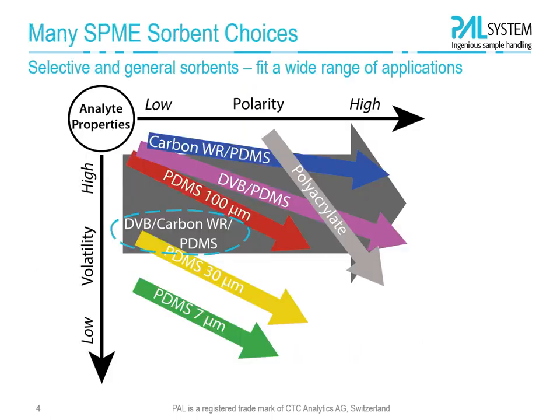As the name says, SPME lives from the solid phases, the sorbent materials of the coating. Here we see the various sorbent materials in use for analytes of high and low polarity and also of different volatility. PDMS, for instance, covers a range of VOCs and semi-volatiles with a different coating thickness. PDMS is also present as the glue with more polar sorbents like divinylbenzene, DVB, or the polyacrylate.